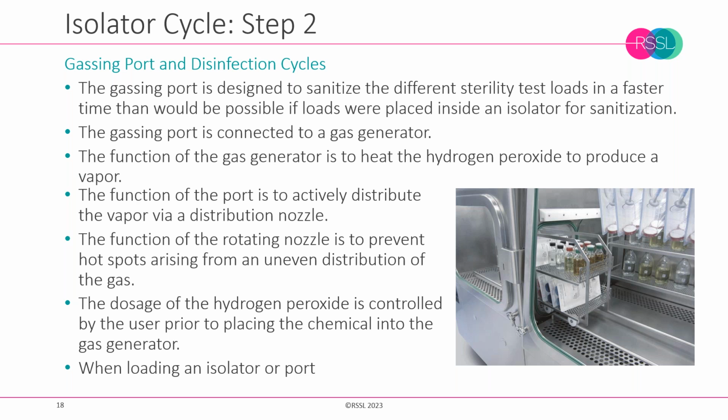There shouldn't be any part that isn't reached, and we would then qualify that, as you should see, through biological and chemical indicators.